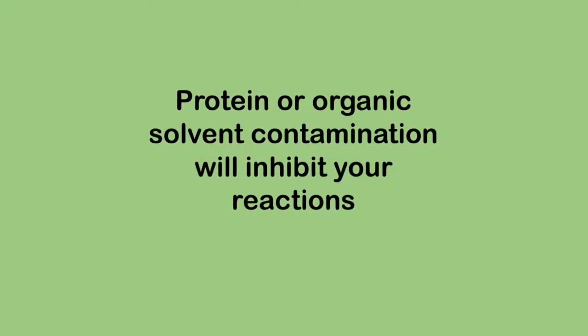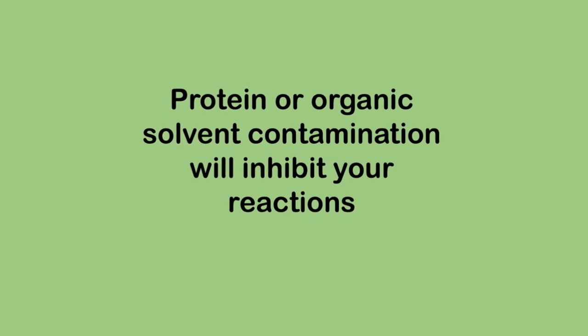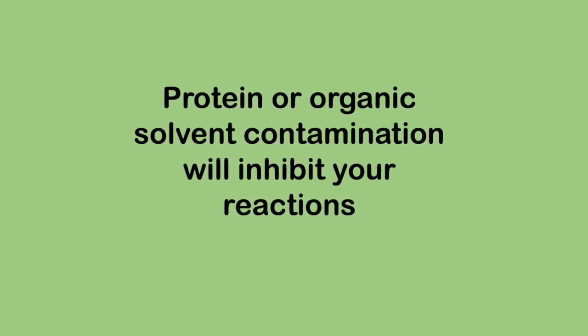So let's move on to that, contamination. Okay, as we talked about in the previous video, your RNA isolation procedure involves separating your RNA from the proteins in the cells and involves using solvents to actually do that separation. It uses phenol, uses isopropanol. It also involves cleaning the RNA with alcohols toward the end. Therefore, the final RNA that you get could be contaminated with any of those things, and we want to check if those other components have been carried through to our final solution.